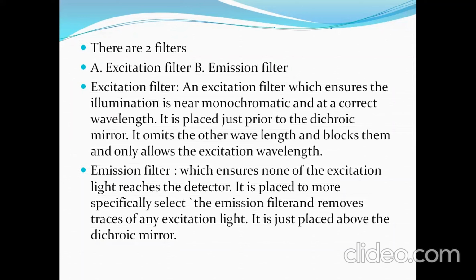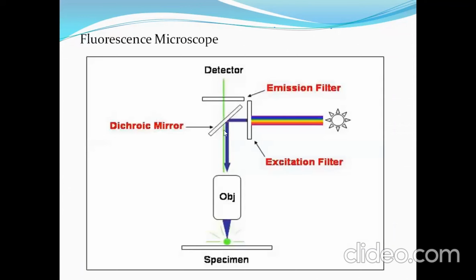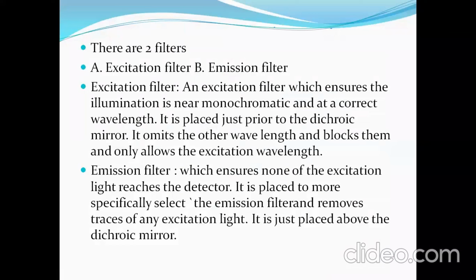I have already mentioned that this is a monochromatic light, whereas when the light is produced with this source, it is polychromatic. So it just allows the required light. That is the function of this filter, and it only allows the excitation wavelength.